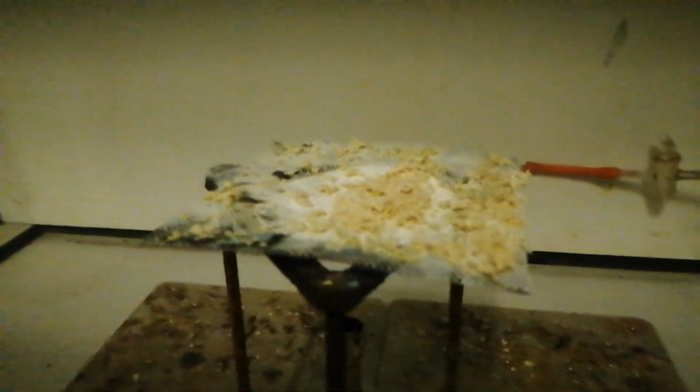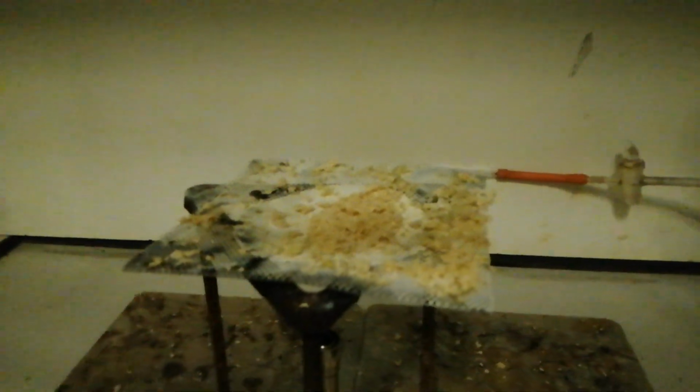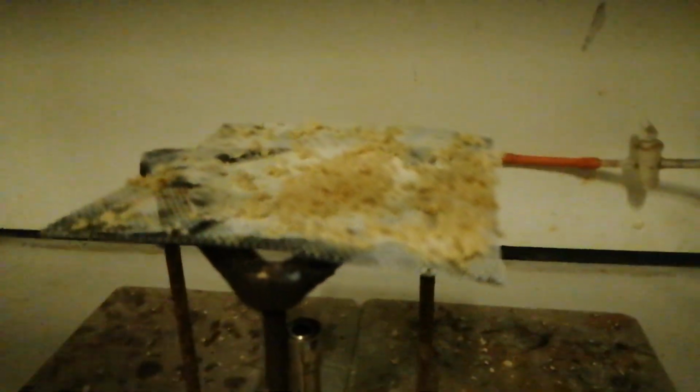I'm going to try this because we're not doing any editing, just to see if it works. It's usually phosphorescent in the dark. Normally you have to keep a lot of light on top of it. It's normally phosphorescent, in case you didn't hear that because the camera was in the fume cupboard. So I'm going to turn the light off and see if it glows. If it doesn't, we're going to shine a really bright light on it in the future and see whether we've made phosphorescent zinc sulphide. Can't see a thing. No, total failure. But anyway, we'll try that again.